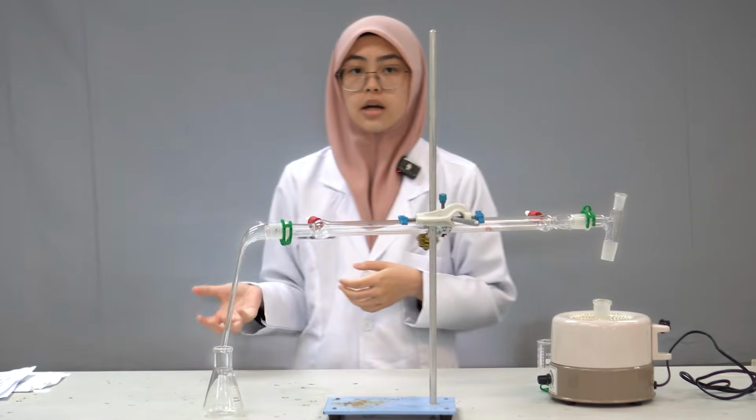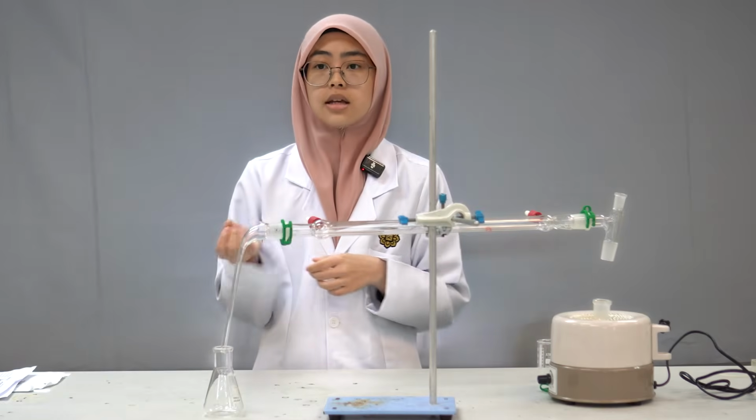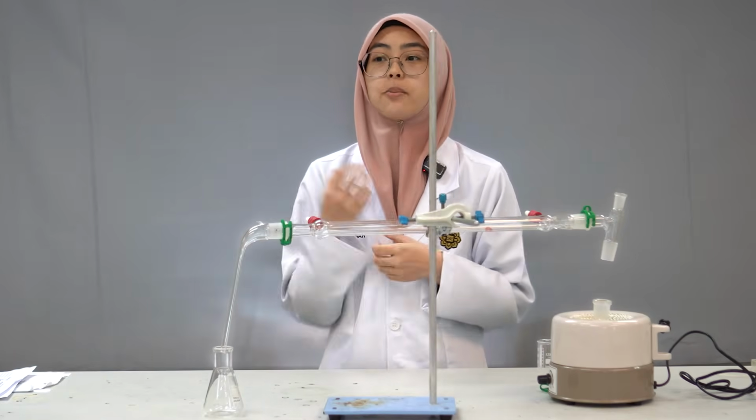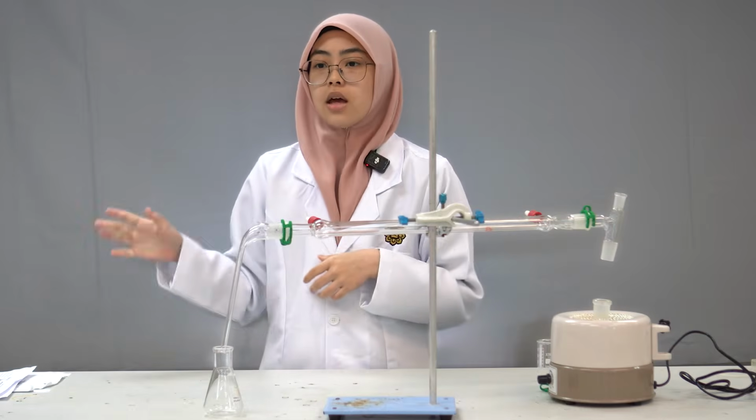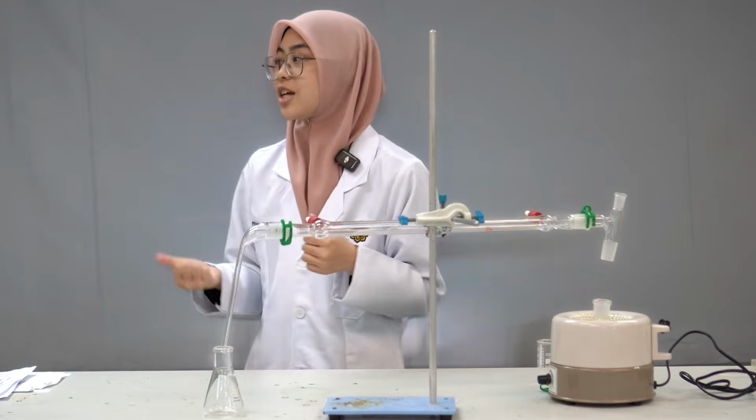And as we remember, the pure dichloromethane is really corrosive, especially toward plastic, so do not play with it like water. Okay, so that's all. I will pass to Najwa Sila.